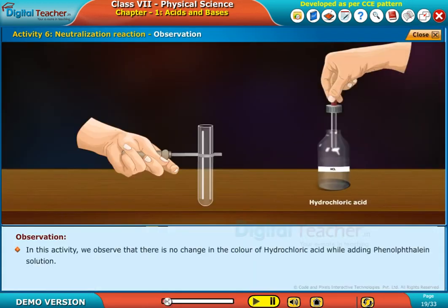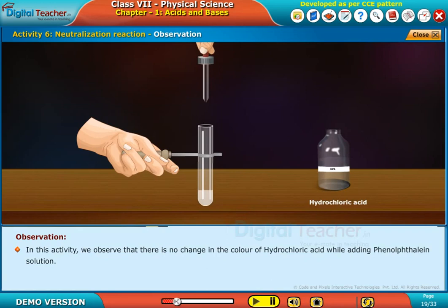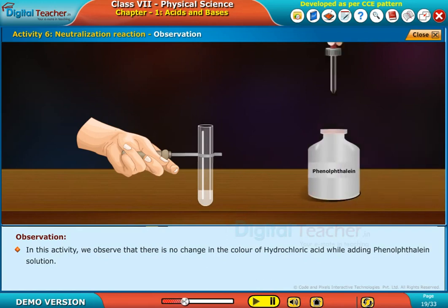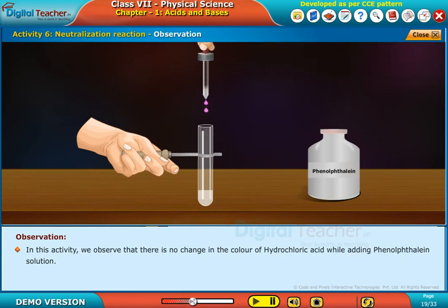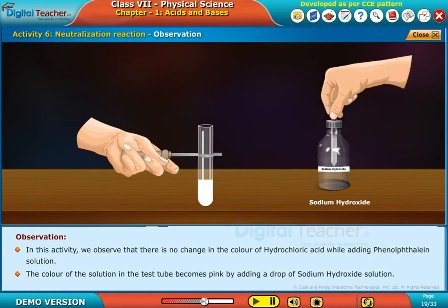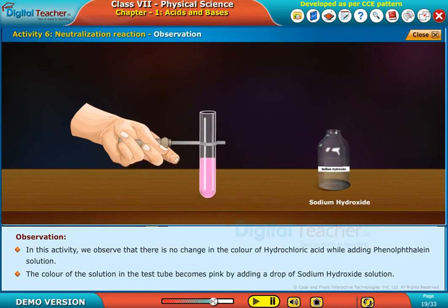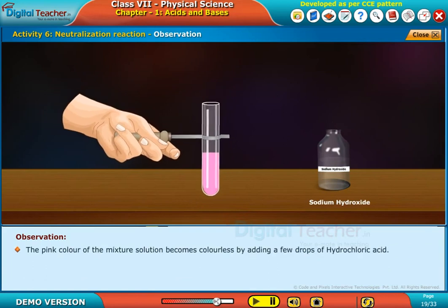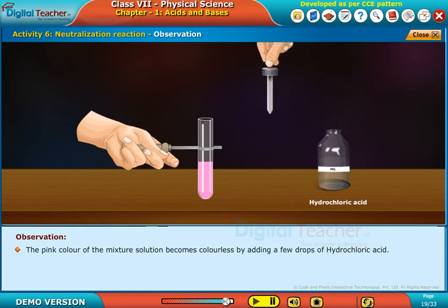In this activity, we observe that there is no change in the color of hydrochloric acid while adding phenolphthalein solution. The color of the solution in the test tube becomes pink by adding a drop of sodium hydroxide solution. The pink color of the mixture solution becomes colorless by adding a few drops of hydrochloric acid.